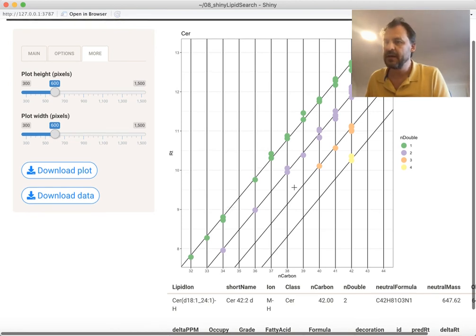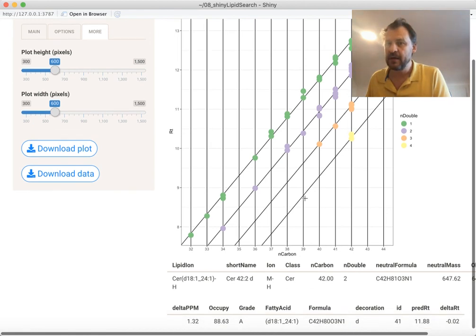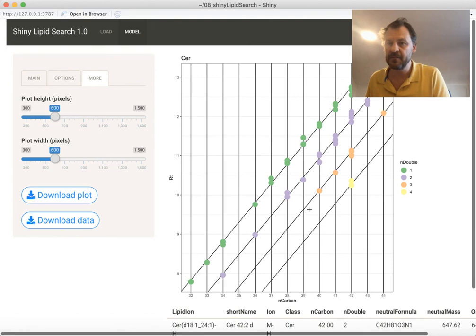If the difference on average between the D and T species is, say, 0.5 minutes, then this difference will have been subtracted in plot data so that they can be plotted in the same plot. Otherwise, they would be too far apart. So the 2 sheets are not exactly the same. In plot data, the effects of the 2 factors, ion and decoration, have been removed by subtracting them. I hope that I've covered everything, and I hope you can explore the data with this.